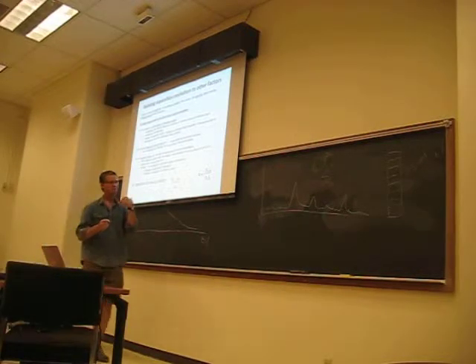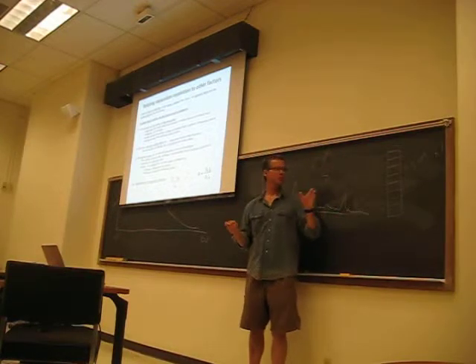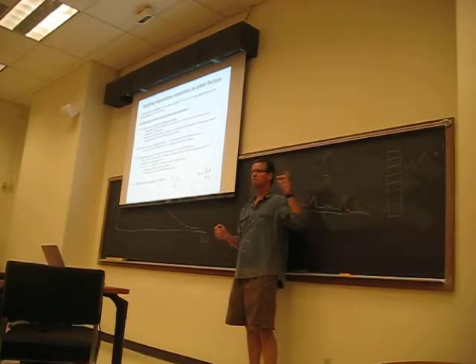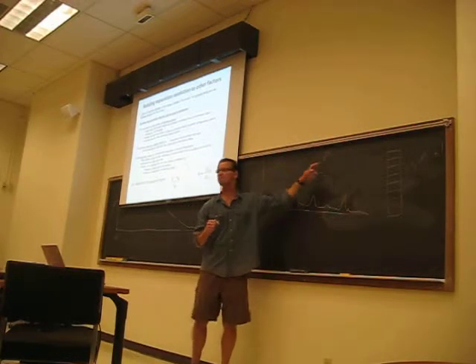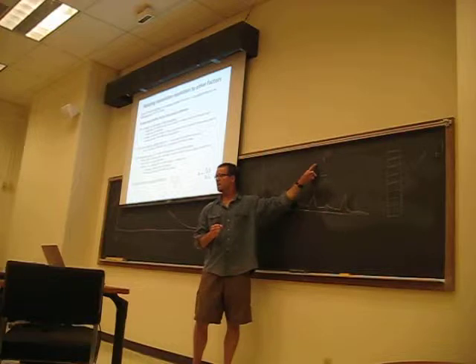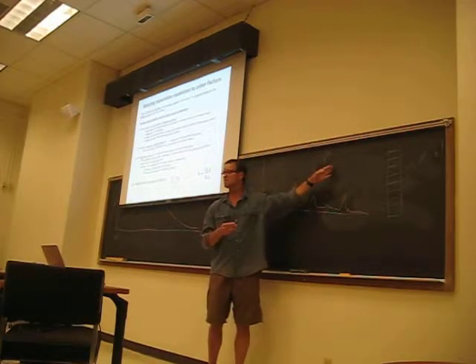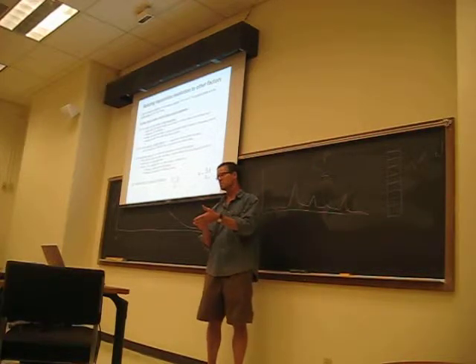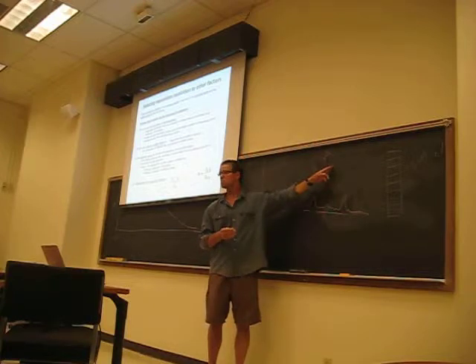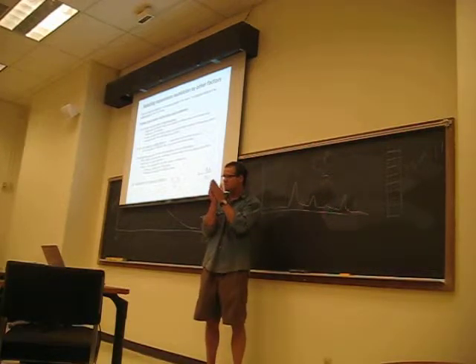All right. If you were to go to the Dionex website, or the Waters website, for all these manufacturers, many of the columns they sell come with different particle sizes or different bead sizes. Of course, it's not just about having smaller beads per se, because there are sometimes downsides that come with smaller beads. It becomes much harder to push fluid through the column when it's packed with smaller beads, because there's less space around the beads as they're packed more tightly.